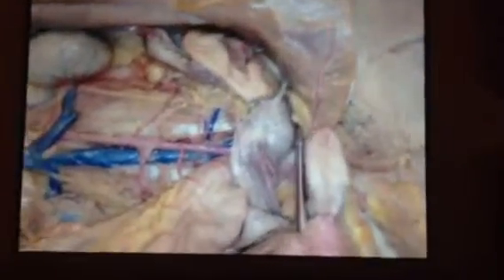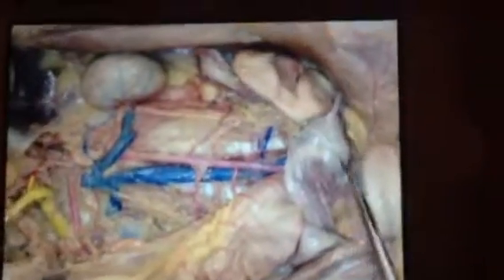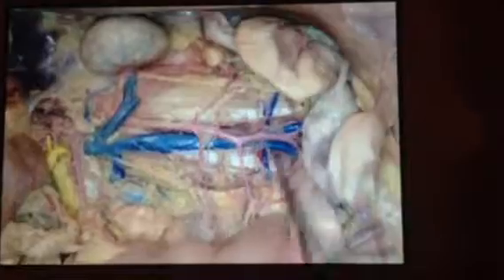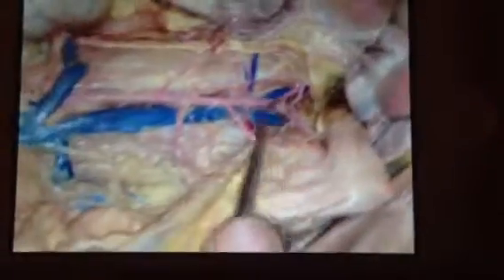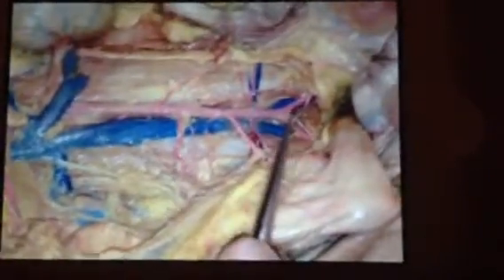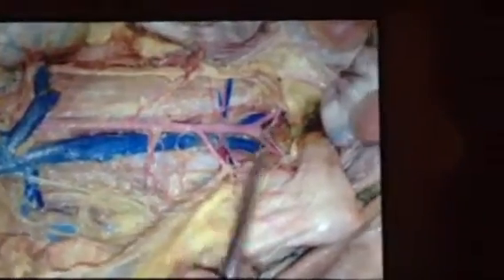And like I said, down there is the lumbar artery and vein. Artery being red, vein being blue. And then really down here low, we have in the cat, we split like external iliac, and then in that is internal iliac.